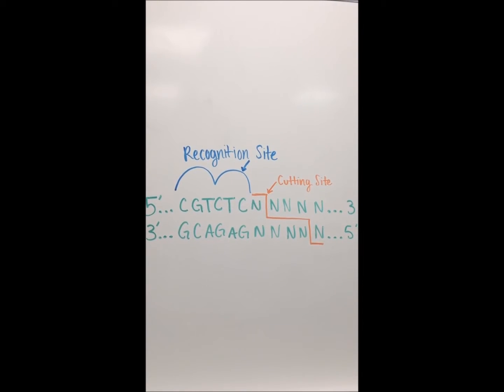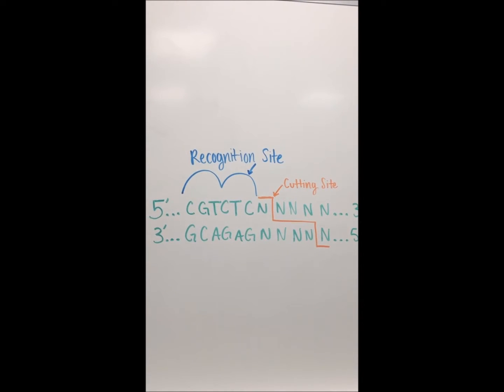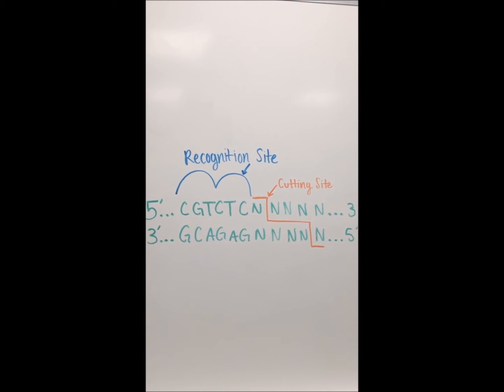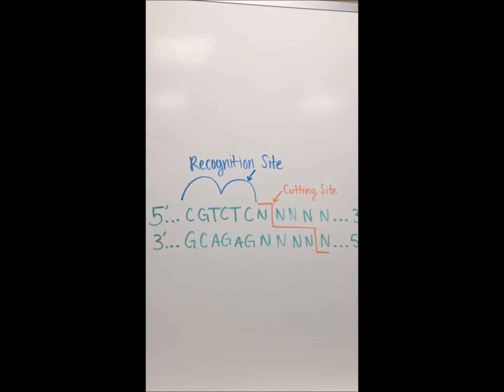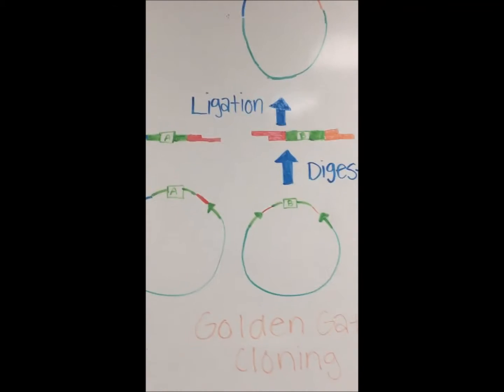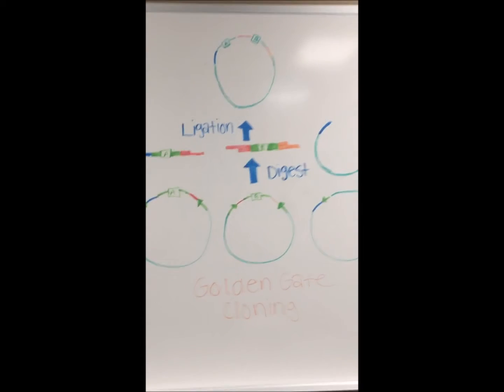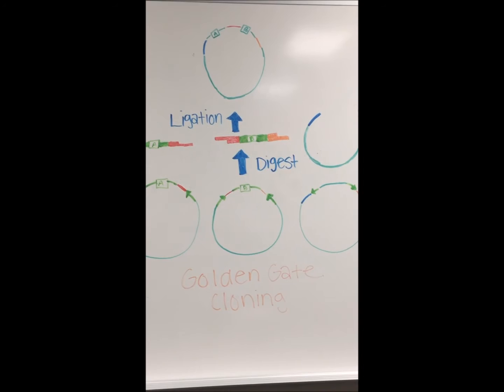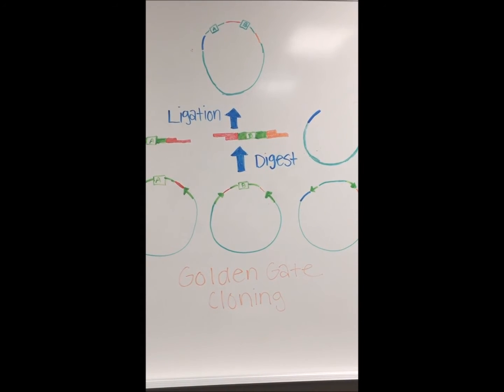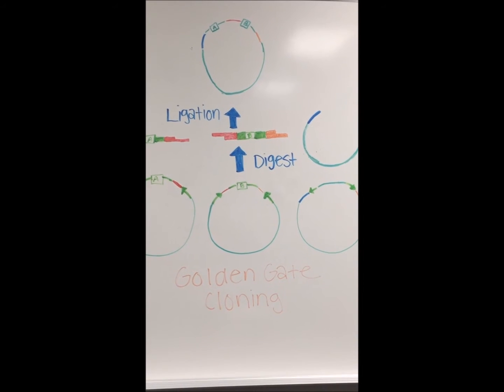Their recognition sites are not palindromic and therefore are directional. Type 2S endonucleases create 4 base pair sticky ends next to their binding sites, regardless of the adjacent nucleotide sequences. If a part is flanked by 2 binding sites for type 2S restriction endonucleases, digestion will lead to predefined sticky ends at each end of the part. If a destination vector is added that contains specific type 2S restriction sites, its intermediate piece gets replaced by the assembled parts.